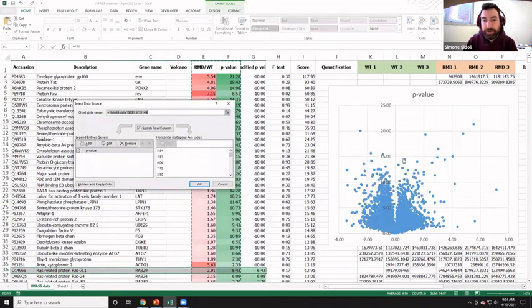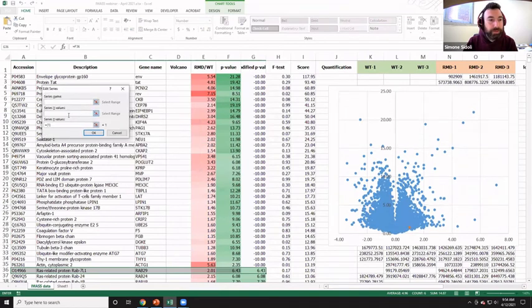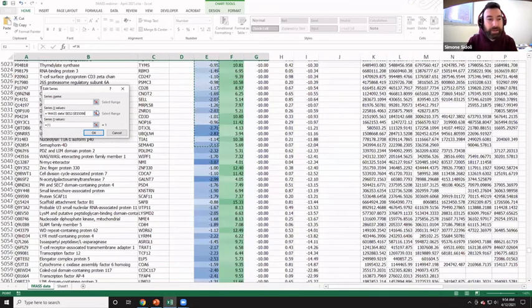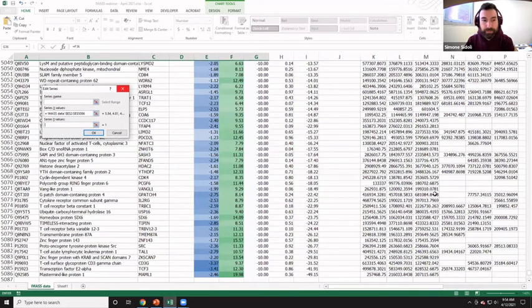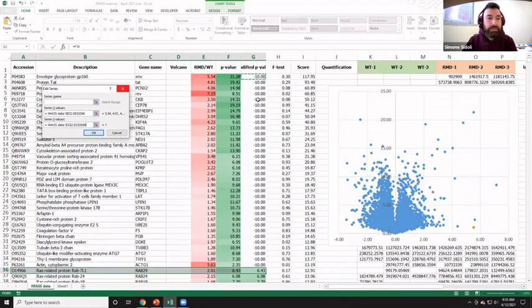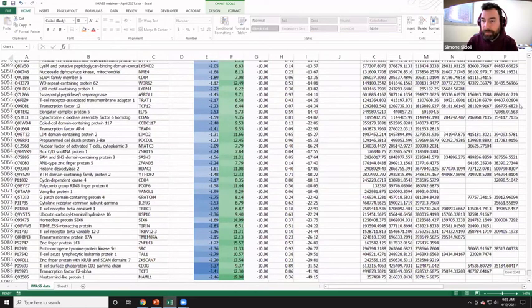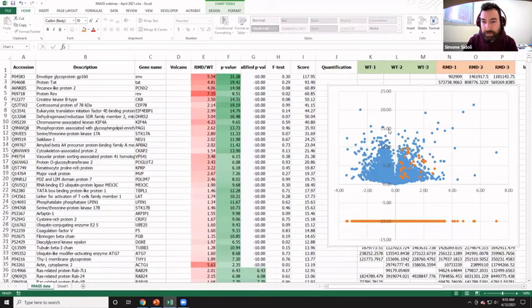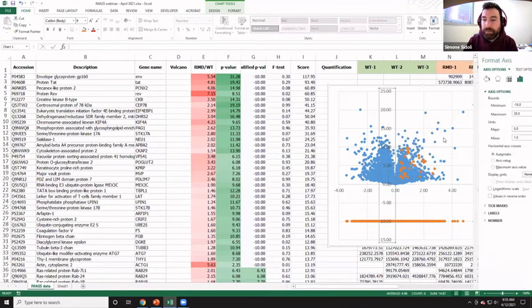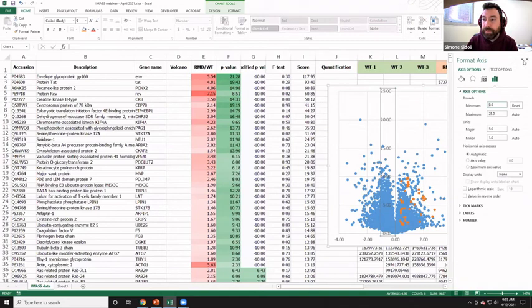So why did I tell you all of that? Because if you want to display this now in your volcano, you can add an extra layer where the x-axis remains the fold change, and then the y-axis becomes the modified p-value. And then now what you have, let me just remove this, put back only positive values.